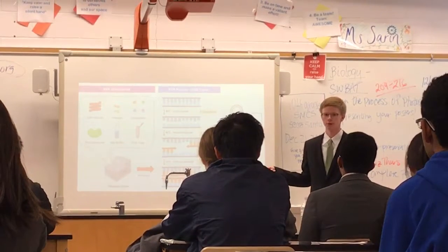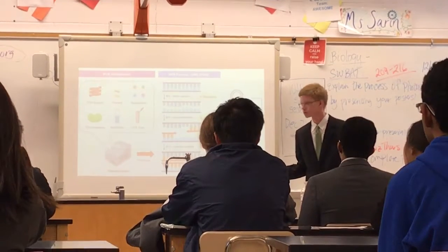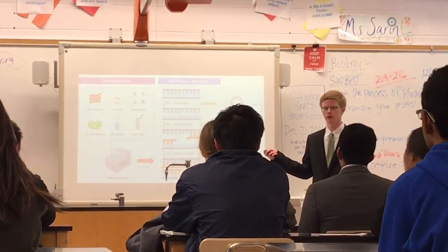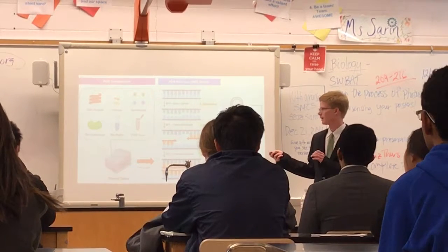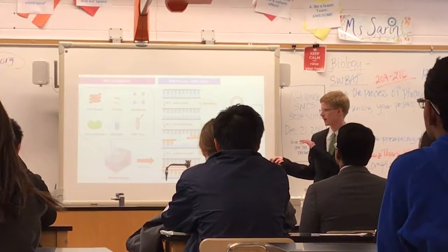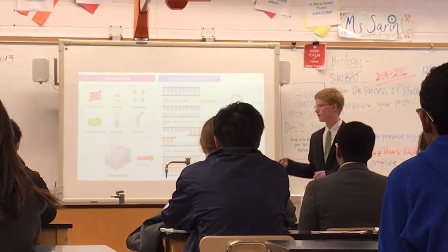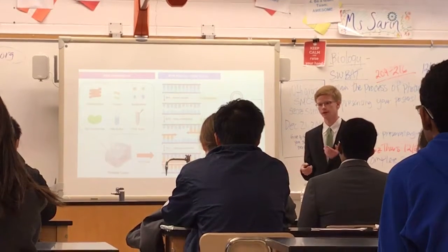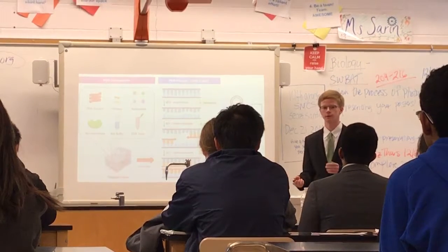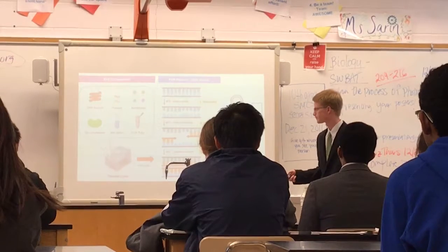So what happens in a PCR machine is it's really just a temperature cycle. So you have this strand of DNA right here, and once you bring the temperature up, the strands break apart. And once this happens, the Taq polymerase will go in and add these new dNTPs to each side, and all of a sudden you have twice as much DNA as you had before. And if you just let the cycle go, I did like 30, 40 times for different procedures, you get exponentially more DNA than you started with, and then you can actually use this for sequencing, you can use it to study. It's much easier to work with.